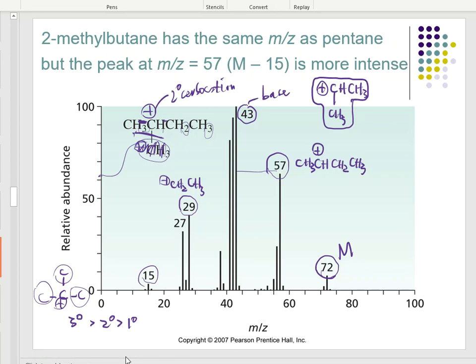The more friends you have around you, the more eyes that you can basically be on you at all times, and that stupidness can be prevented. Same way with molecules. More friends, carbons, brought to the club in the molecule can help protect that carbon in the center from reacting. And stability is very important when it concerns a fragment.